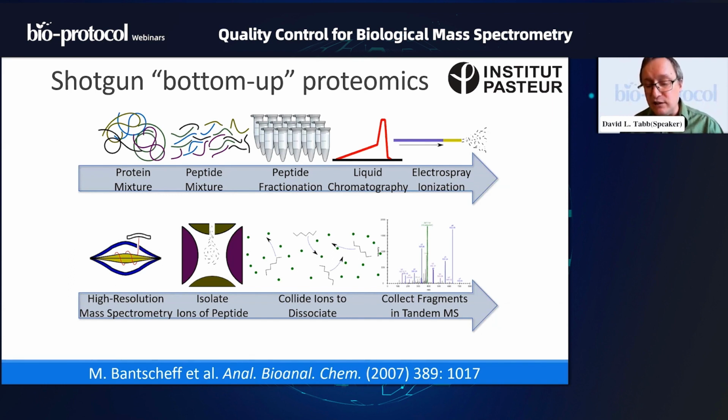And by measuring them at high resolution, we're able, first, to resolve them, to be able to say these 2 ions have very similar mass to charge values, but we can tell them apart through the resolution of the mass spectrometer, but also to be able to say which ions are most intense compared to all the other stuff below them, and to be able to see the separation of isotopes for them as well, which allows us to say, if we're only interested in examining +2 or +3 ions, we're able to tell the instrument, acquire tandem mass spectra only from those.